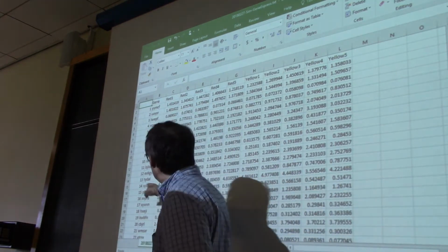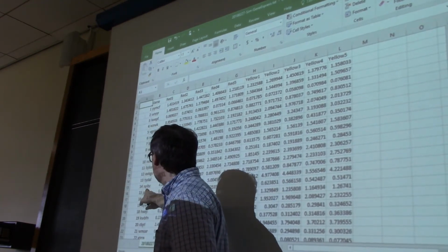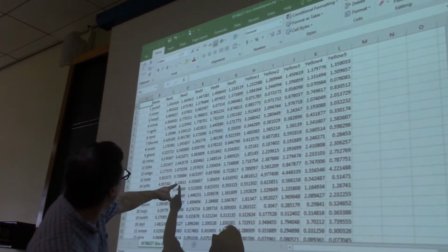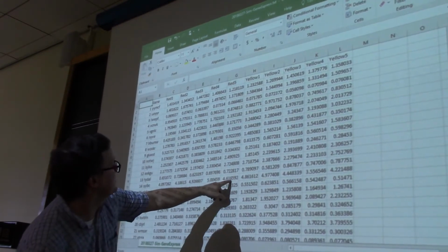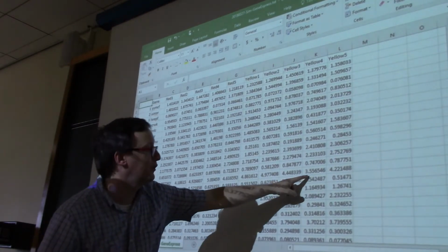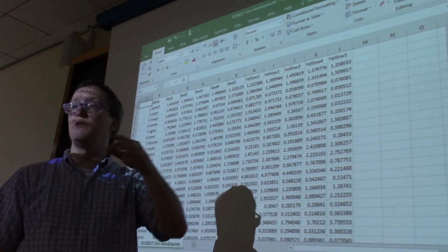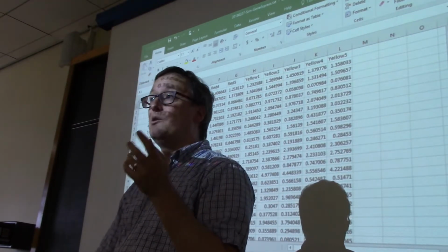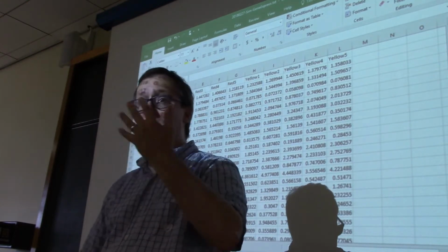Number 14, is that row 14 or is that number 14? Number 14, so SYLBC. All right, so as we look at this, we've got 4.09, 4.18, 4.92, 5.0, and 4.6, and on the right we have 4.86, 4.97, 4.44, 3.55, 4.22. You feel good about that one being a difference? Okay, I happen to know it's not actually in this case.